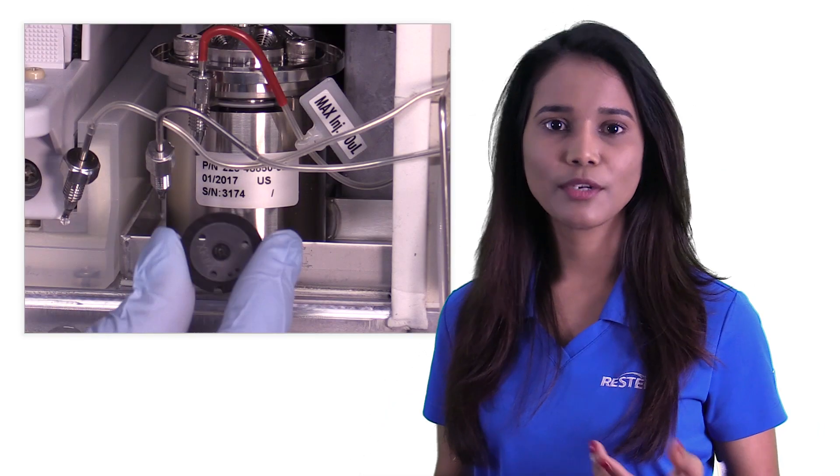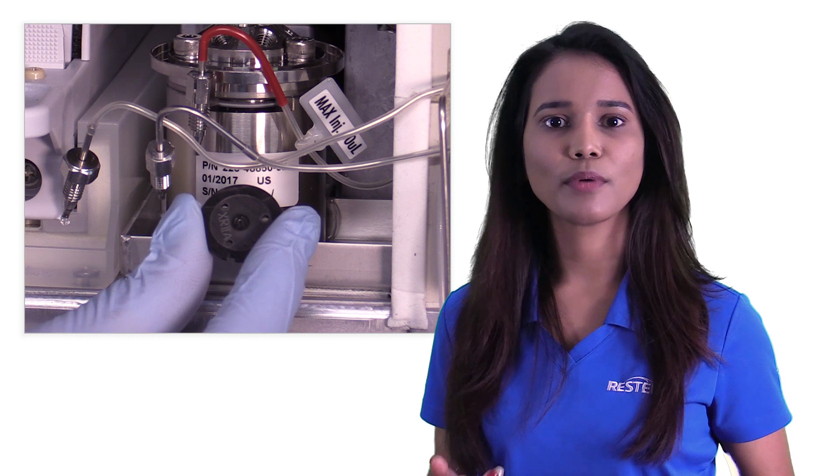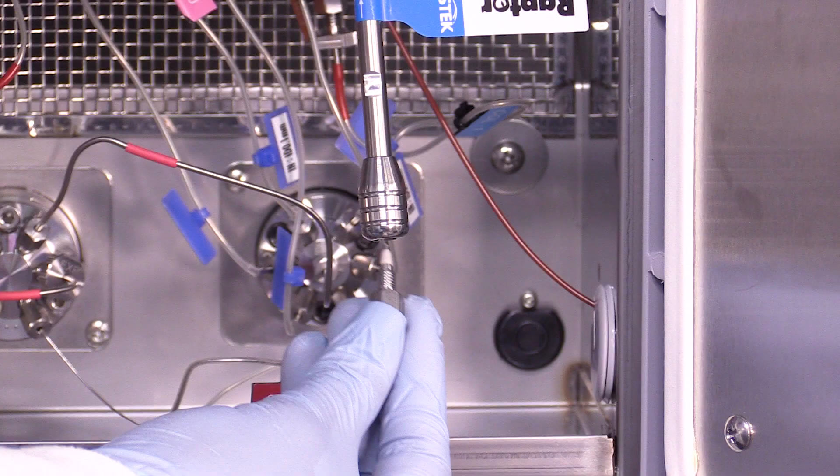At times, normal wear of the injection valve rotor seal and pump seals also generates particulates that can clog the column packing bed. You can avoid this by simply replacing the parts as a part of your routine preventative maintenance schedule.